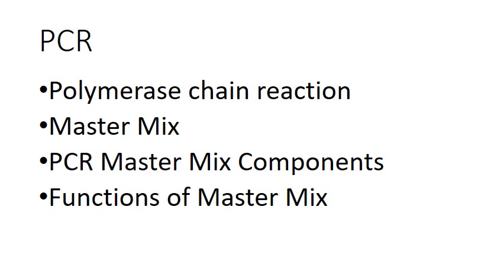In this polymerase chain reaction, we were talking about the steps included and how you needed certain components to run this PCR. In case you missed that, you're going to want to go back to the last video talking about master mixes. It talks about everything that you need to run a PCR reaction. So if you're thinking about running PCR, make sure that you have all the components, and to do that, you want to look at the master mix video. PCR master mix components, we talked about a few of those and what they do, so you're going to need to know the functions of all of them. So let's go on.